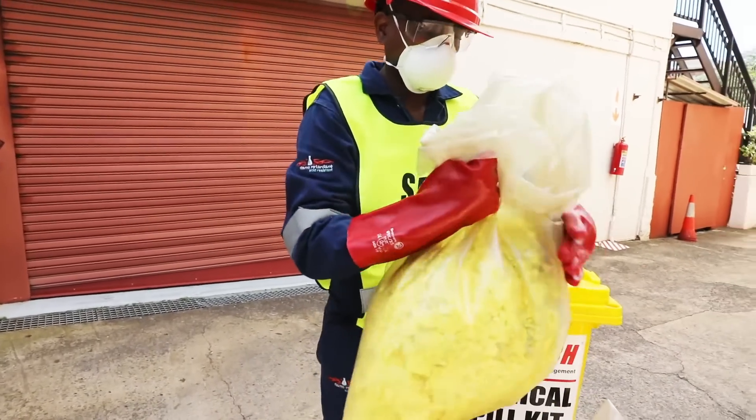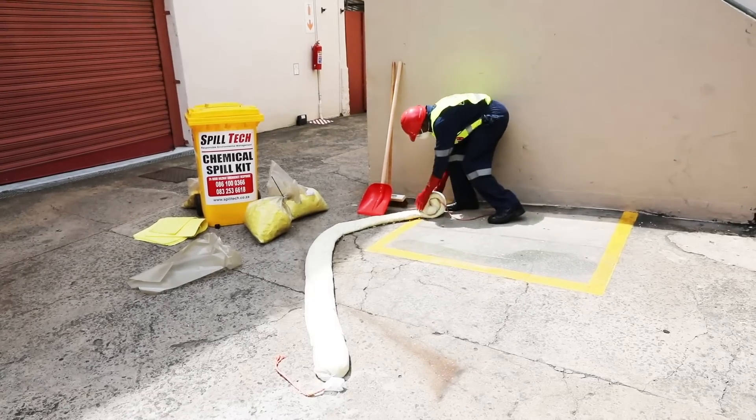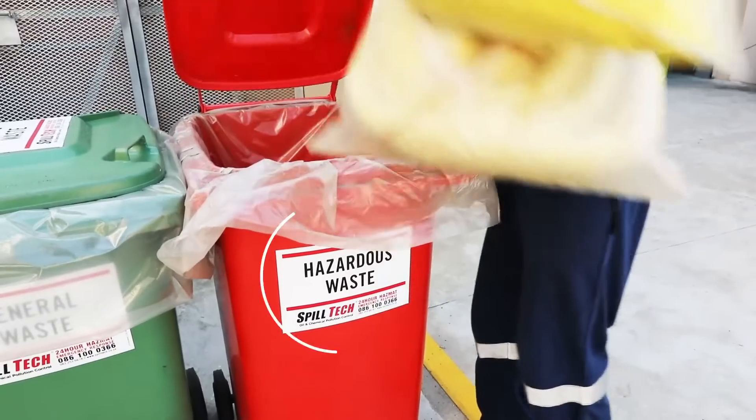The waste residue must be disposed of in the bags supplied in your kit, and these must then be placed in your hazardous waste skips or bins.